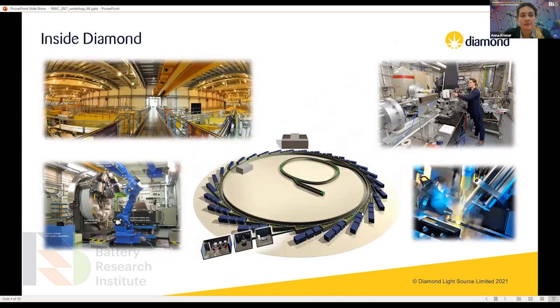What you can see here is one example of the beamlines, a model of it, where each beamline is divided into 3 sections. There is the optics hatch, with a set of mirrors and monochromators, which give the right conditions to the beam; the experimental hatch, where the users set up their experiments; and when they are ready to go, everything is controlled from the control room.